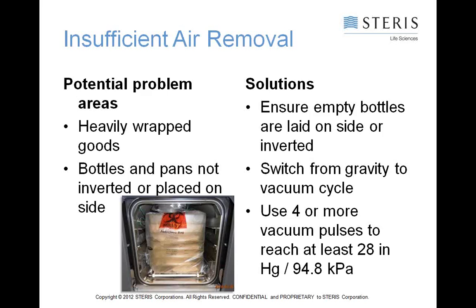If you're going to load up your glassware bottom down, remember that you want to choose a pre-vac cycle. Make sure you're hitting that button and not the gravity, because that air will get stuck on the bottom of the beaker or flask or whatever it happens to be, and have a very difficult time getting out.